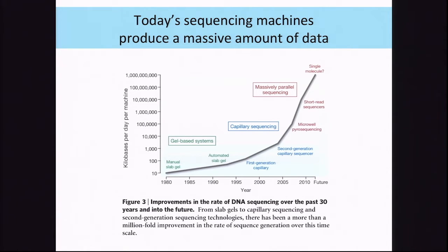Now, today's sequencing machines have improved dramatically over the decades. We have so much data now, so we need to think of sophisticated ways to process it.